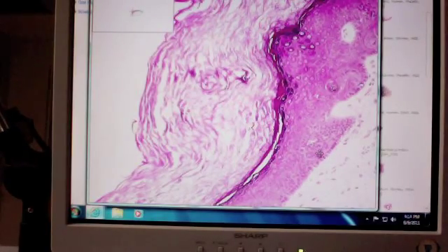When you asked what kind of gland, do we say sweat gland? If I asked you what kind of gland in this case and you said sweat gland, I would give you the answer. But really, at this stage, because we have not yet done skin, what I'd be looking for is the simple coiled tubular gland. Sweat gland just happens to be a great example.